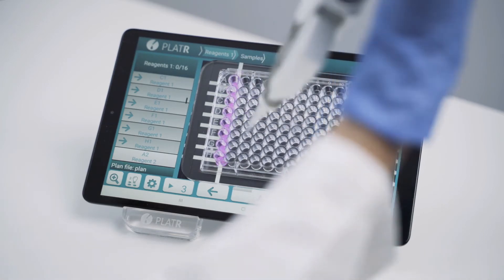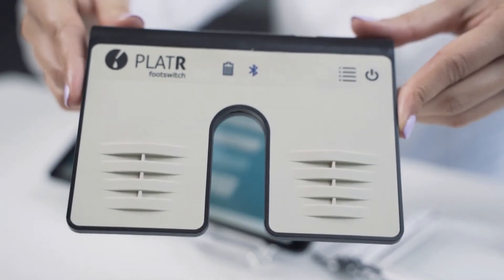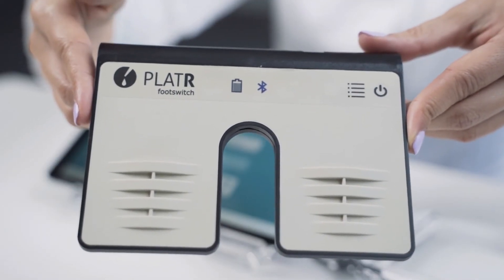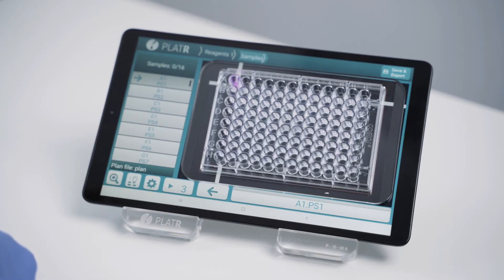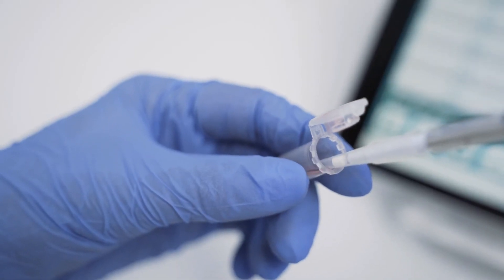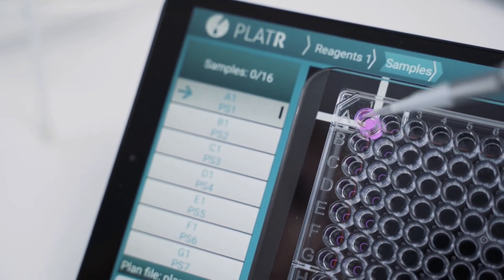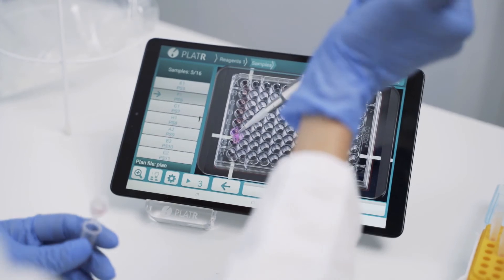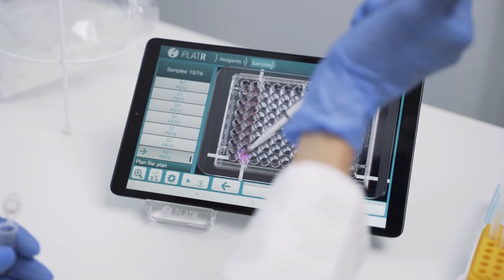To move forward, you can tap on the spacebar, use a timer, or preferably a footswitch. We will now add samples, so I'll change my setup to a single channel and add all my samples to the plate one by one. This really helps me to avoid mistakes and pipetting is much less stressful.